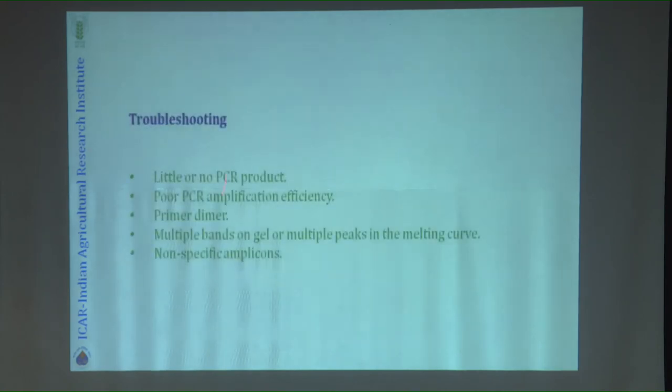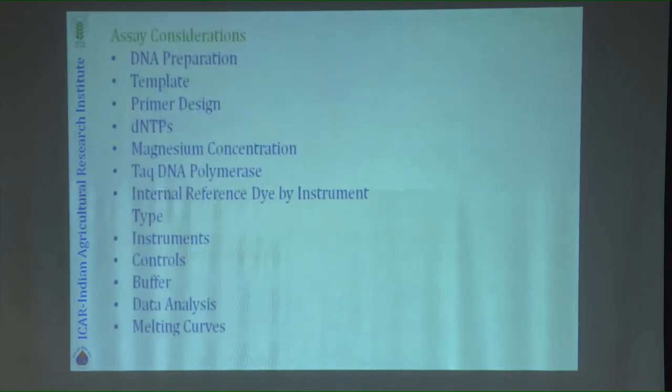There are several ways one has to troubleshoot. So there are troubles like little or no PCR product, poor PCR amplification efficiency, dimer formation, non-specific amplification. This, which you see in a normal PCR, you will also be seeing in qPCR. So all these things have to be taken into consideration.